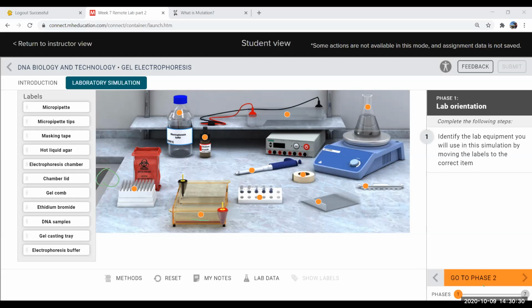Once you have all of that, I'll have you go through the whole lab protocol, and you're going to figure out what DNA fingerprint each patient has for TNF-alpha. Do they have TNF-alpha-1 or TNF-alpha-2? All right, so go forth with all of that.